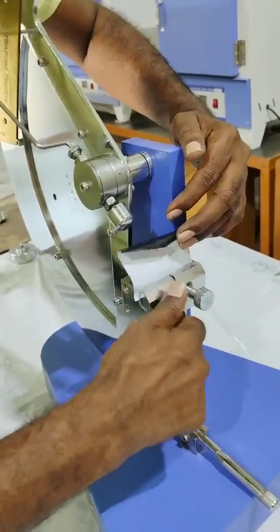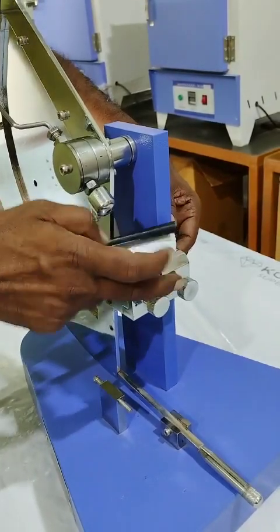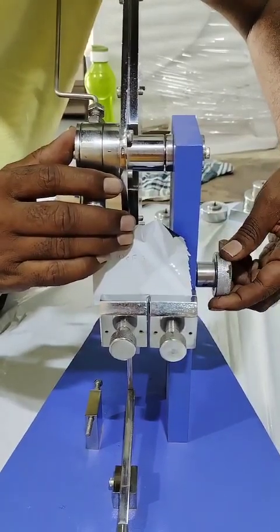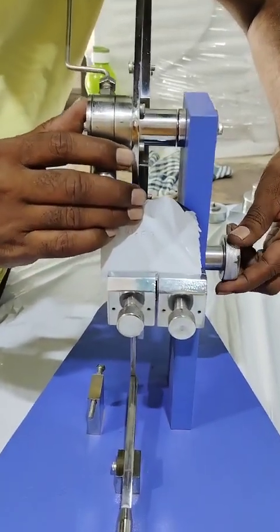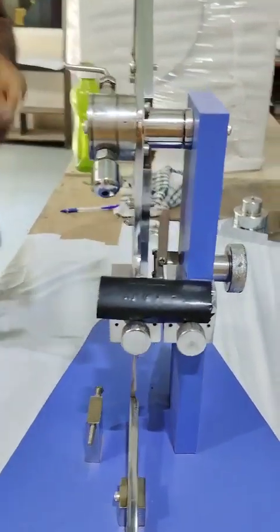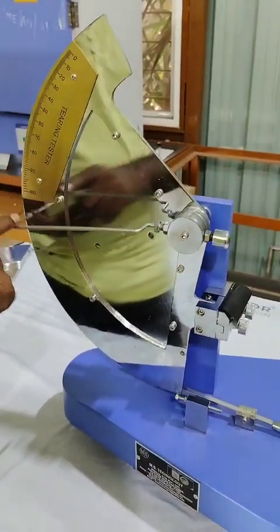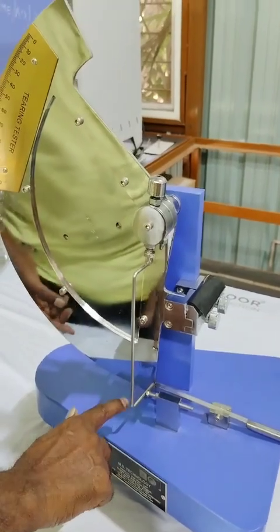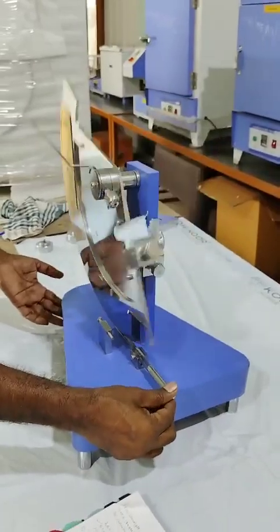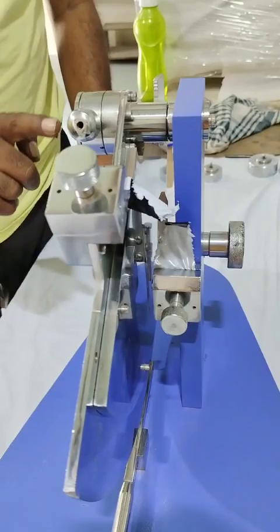Place the sample in the sample jaw properly. Here you can see there is one cutter to cut the first initial slit on the sample. Just rotate the knob and the sample will get cut automatically. Now again take the pointer to the zero position — the initial position — and release the lever. You can see the sample has got cut into two parts.